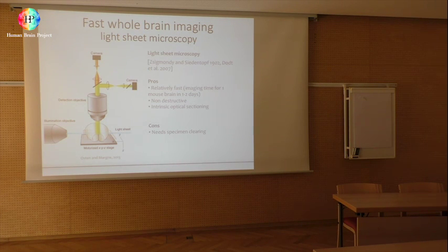That's the point. Was there another question? No, it was related. How long can a slice stay without deteriorating while it is processed? No, this is not a problem. A slice can be imaged many times, so it can stay for a month. And how many devices do you have if you would like to process many brains in parallel? Well, at the moment we have, I will show you, about 2 devices in 2-photon and 2 devices in this other modality I'm going to show you now.